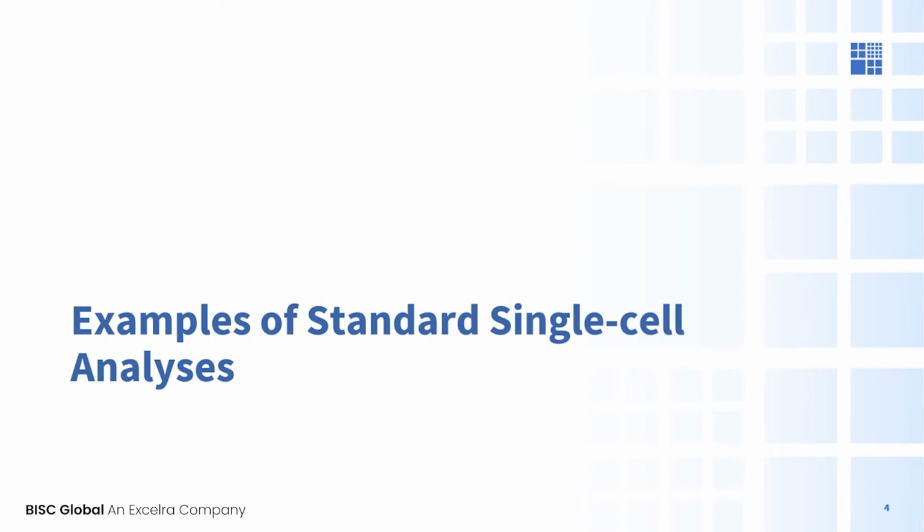All right, so we're going to expand a little bit on each of those steps in the workflow by giving you some examples of what we view as standard single-cell analyses. More information on each of these analyses and figures can be found on the Seurat website.